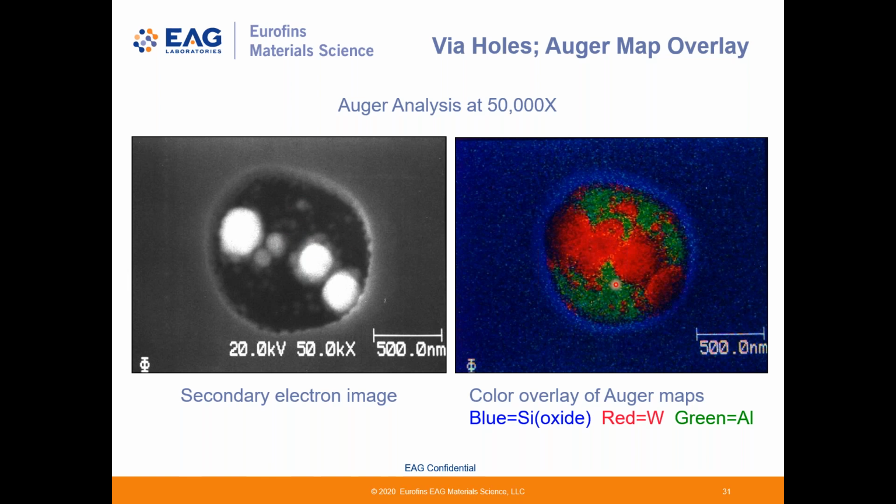And in between here, we just see aluminum. And so these results, plus some other results not shown, spectra within this area, indicated that there was no surface contamination on the aluminum. We see clearly aluminum present in all these other areas. So this indicated that the problem was with the CVD chemistry or the deposition conditions, which led to the bad nucleation results here.